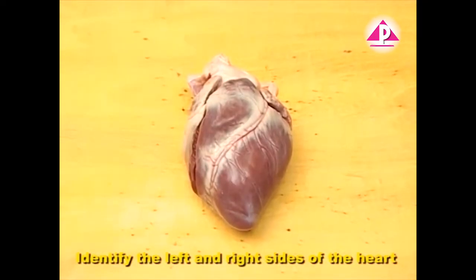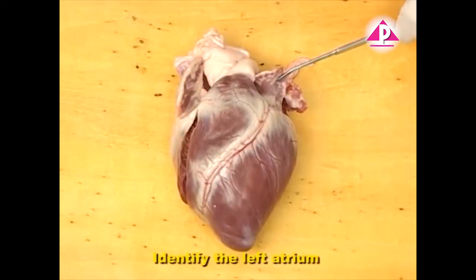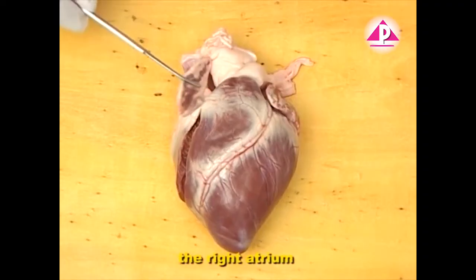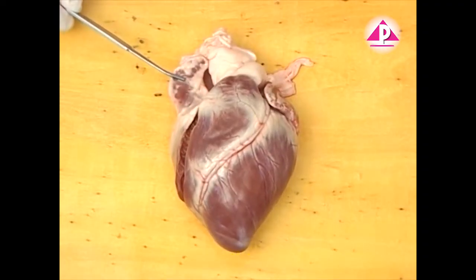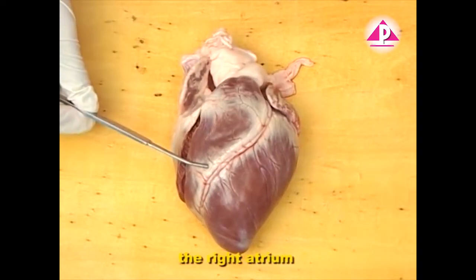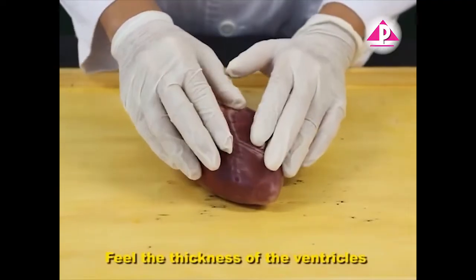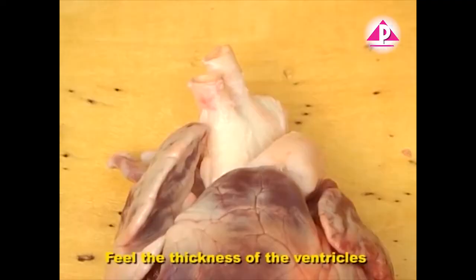Identify the left and right sides of the heart. Identify the left atrium, the right atrium, the left ventricle, and the right ventricle. Press on the heart gently. Feel the thickness of the ventricles.